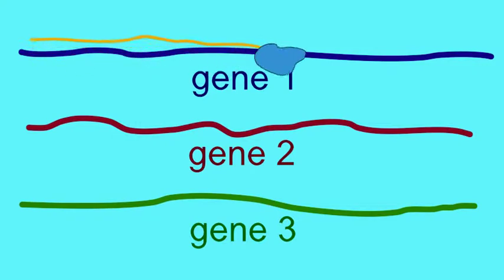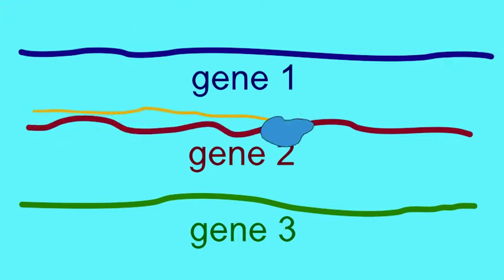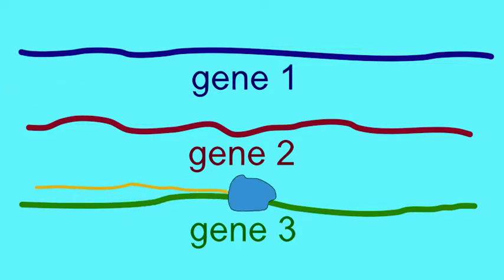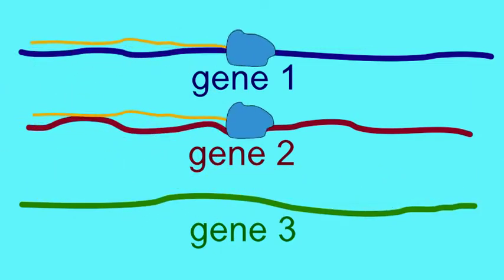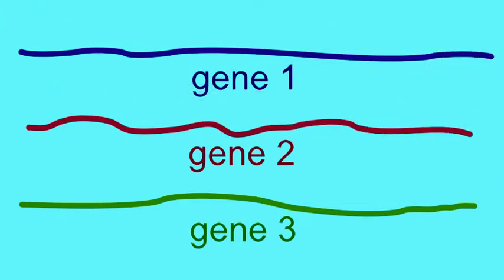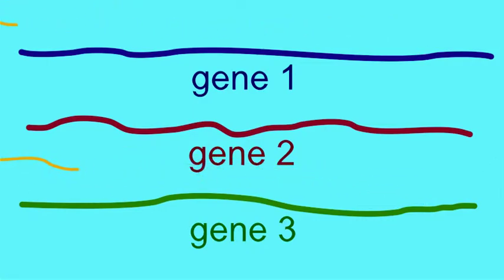There are many applications of northern hybridization, which studies the presence of specific RNA molecules. First, while it is known that a cell may possess a specific gene, it is not known whether it expresses that gene. And so a northern blot can identify if an mRNA is being expressed from this gene by using the DNA sequence of the gene as a probe.